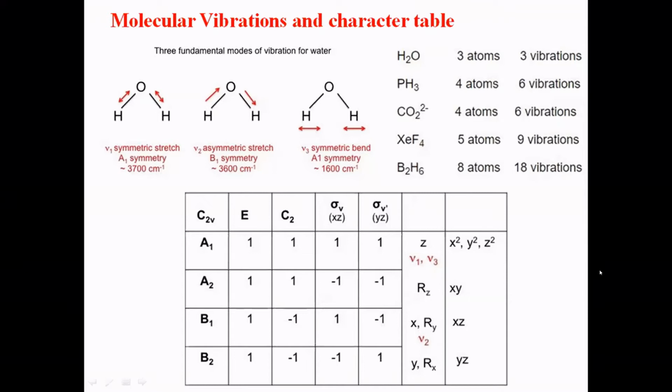These elements represent the possible stretchings and deformations within the molecule. Mostly you would have seen in Raman spectra that the bands are denoted by symmetry elements like E2G, F2G, A2B. These are combinations of the rotation, or the vibrational rotation in space, that it's addressing. That vibration is only respective to a particular wavelength. If it matches, then definitely you will get the band. So we are just matching the structure with respect to the wavenumber.